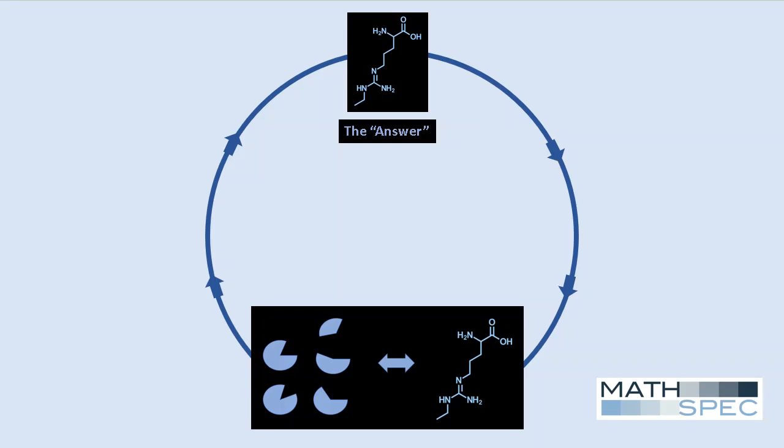The classical approach for identifying an unknown analyte by mass spectrometry is to put the answer into your fragmentation software and then have that software assign fragment ions. This is known as circular reasoning. The big advantage of this approach is that only one answer is obtained. There is no ambiguity in the answer.